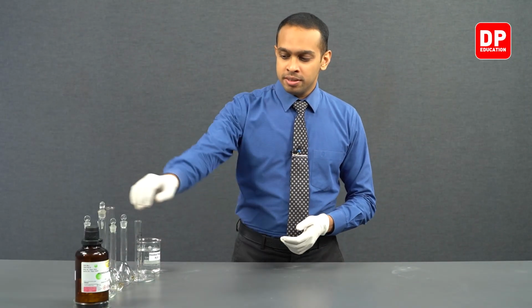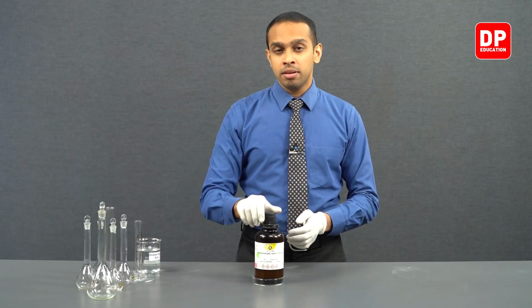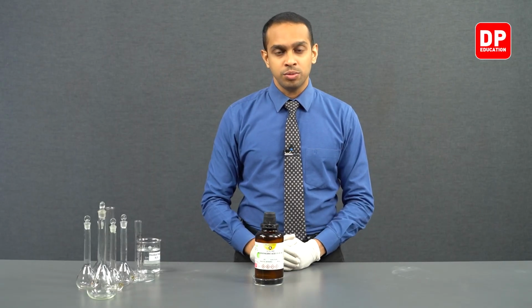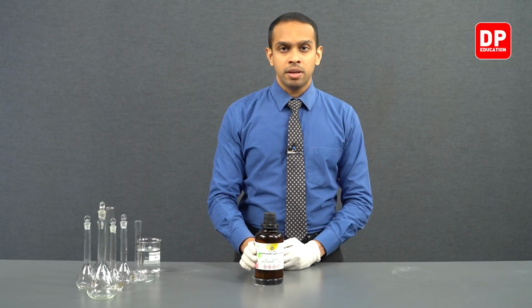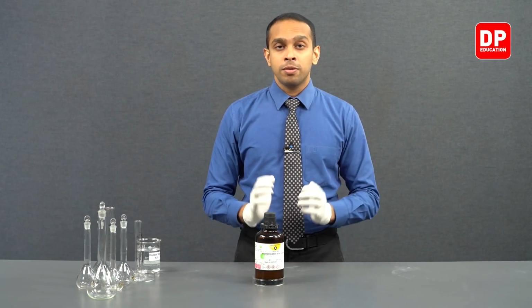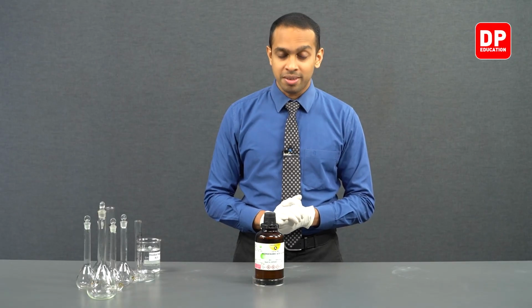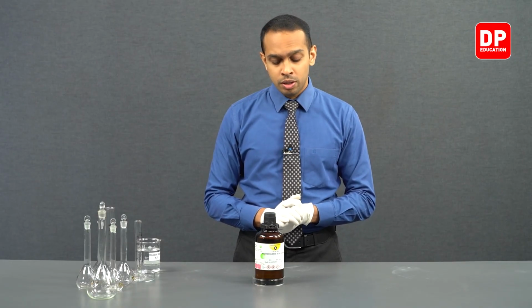Students, in this part, we are going to be using a hydrochloric acid reagent bottle, and we are going to prepare first 1 mole per decimeter cube concentrated hydrochloric acid solution.